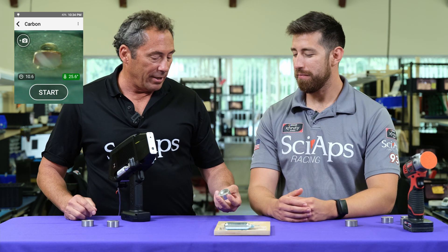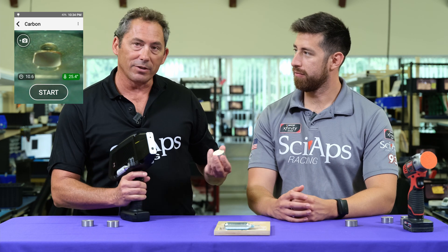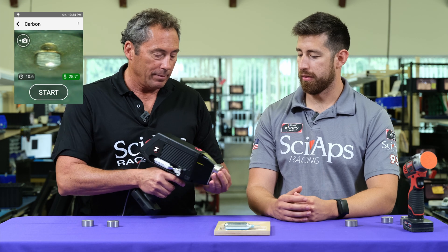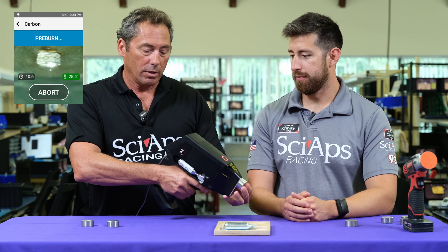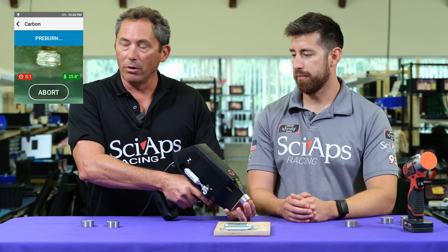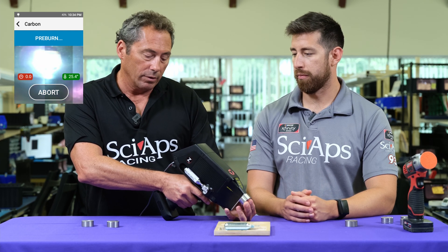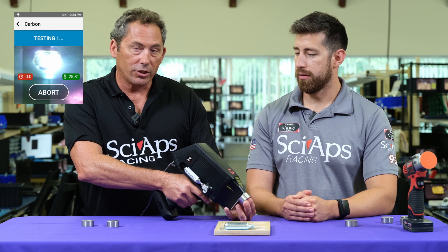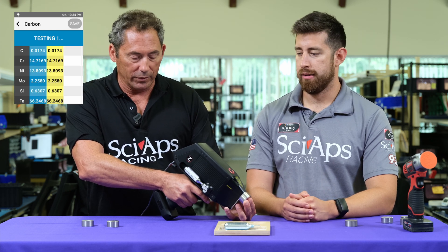So let's choose some L-grades. X-ray doesn't measure carbon, so you've got to use OES technology. We're going to set it up — it's set up for a pre-burn. Pull the trigger. You see the pre-burn going; it's just burning off any residual surface contamination, carbon, et cetera. And then it starts showing three or four results in a row.